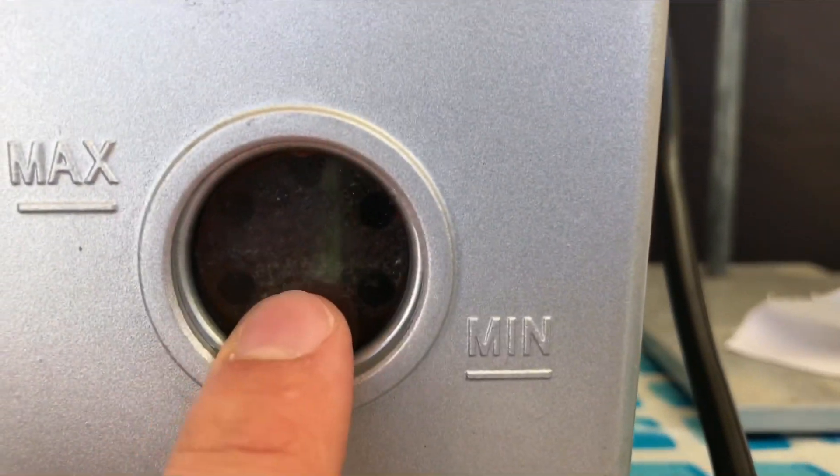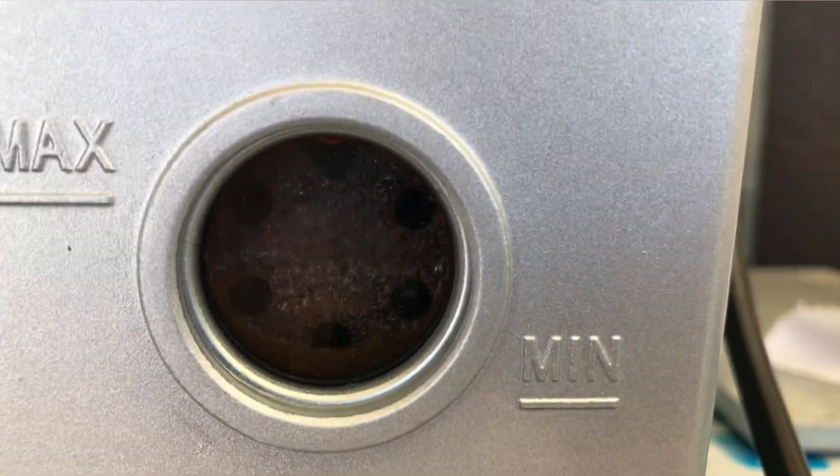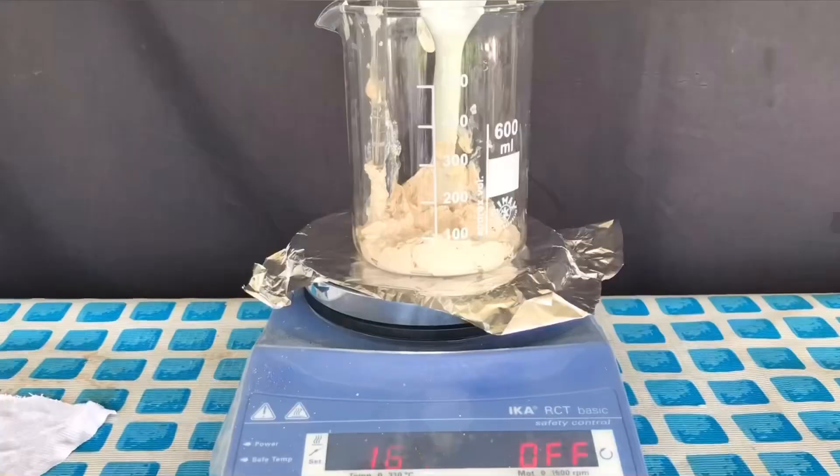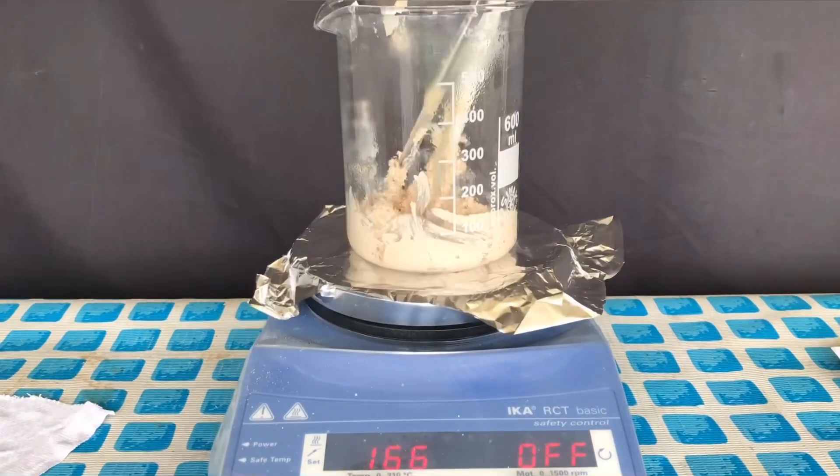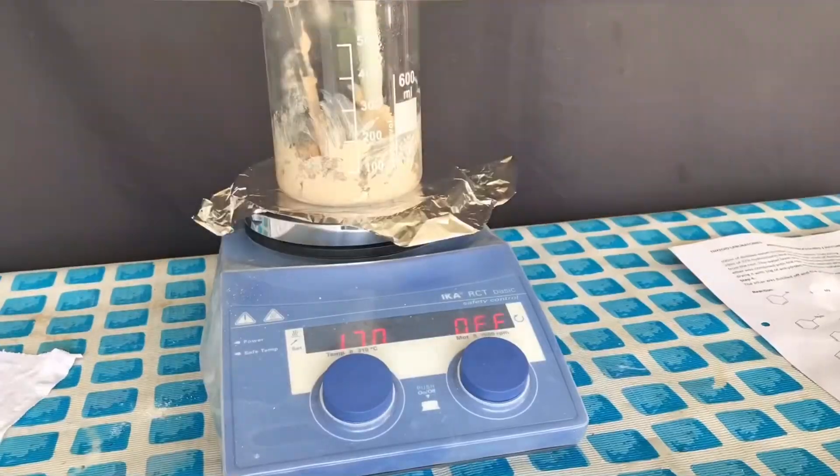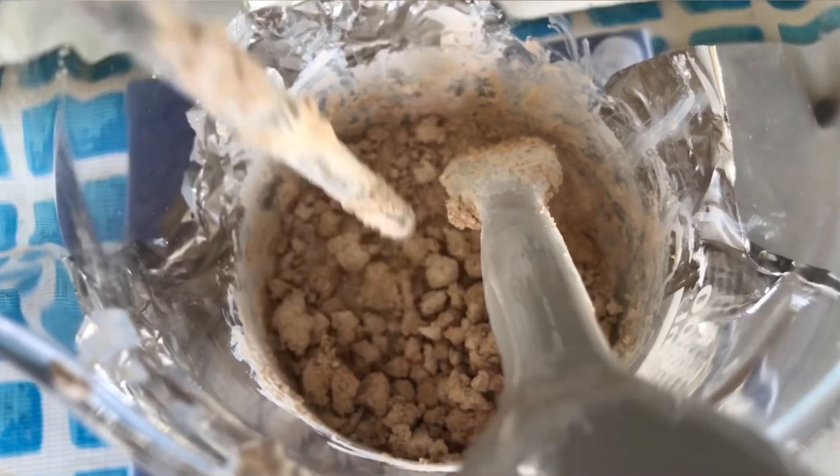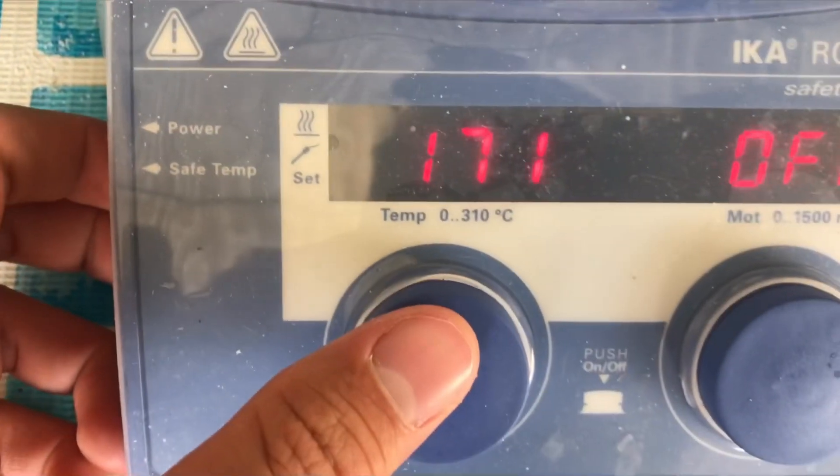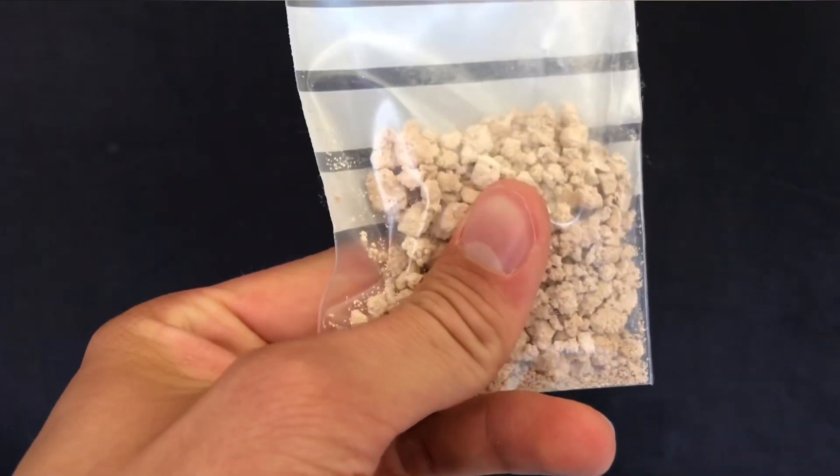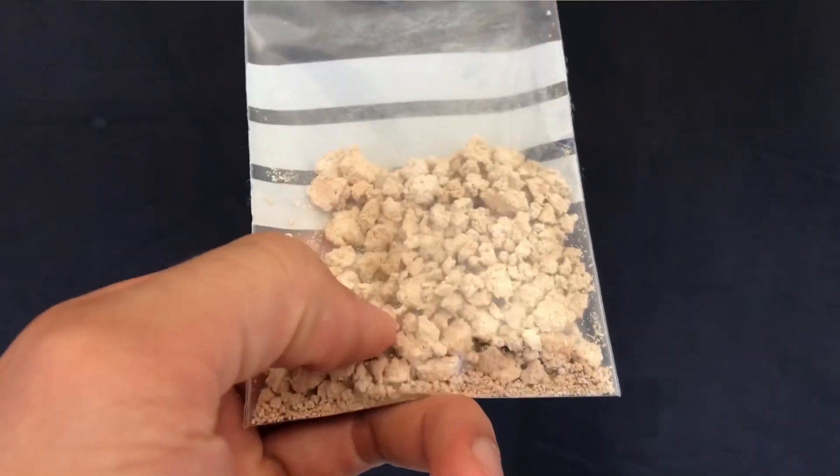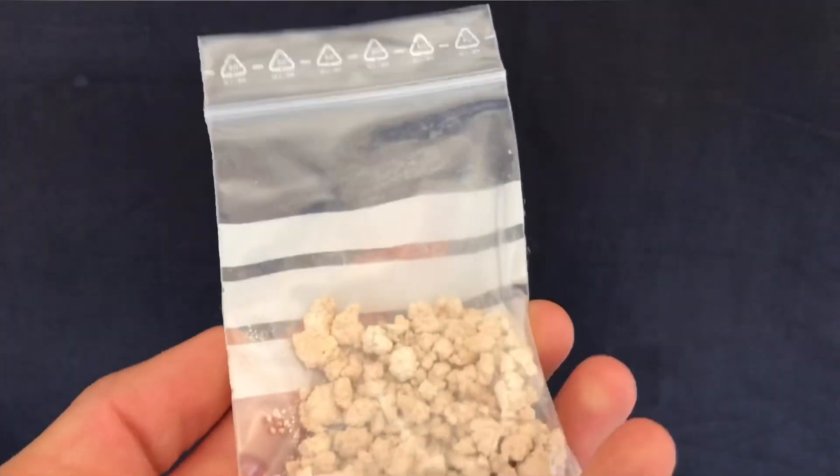I also used the opportunity to change out the oil because it looked bad. The product was dried on a hot plate at 170 degrees Celsius until it was completely dry. Once it wasn't nearly dry, the hot plate was turned off.